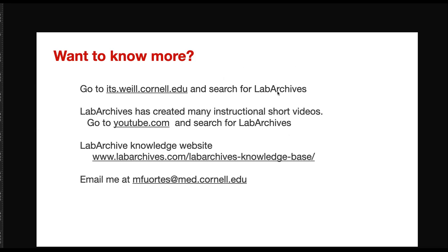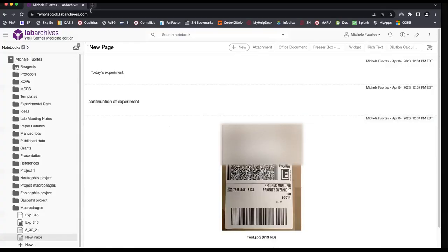Okay, and if you want more information, again, you go to the ITS website, you just search for LabArchives, and you find the page which has a lot of different resources. I can show you right now, actually.